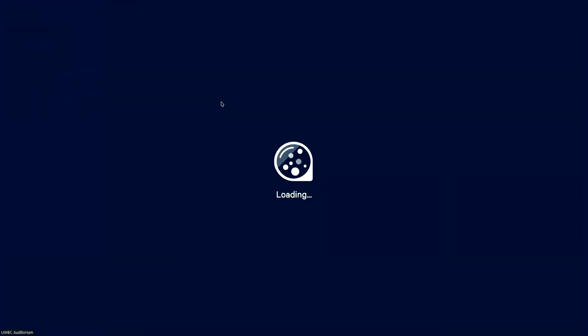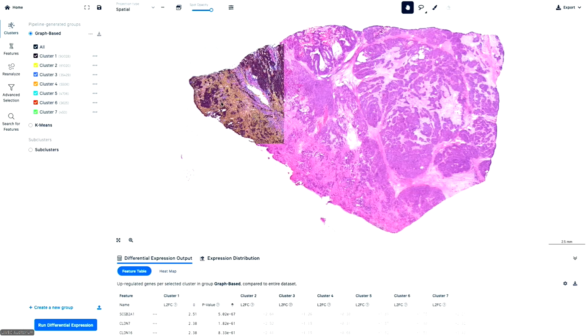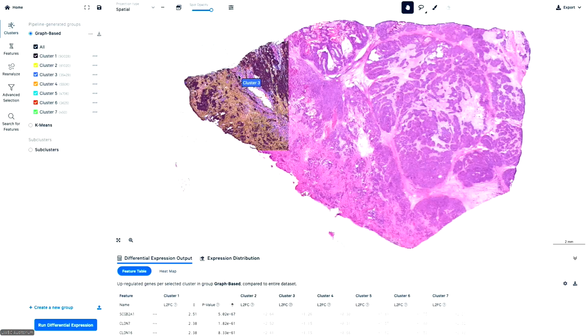One thing I forgot to mention is that the data set I'm going to show you today, the single cell and Xenium, are matched in the sense that we generated the single cell and Xenium data from the same FFPE block. This one here is not matched. We didn't have a Visium HD data set from the same FFPE block, but we did have a human ovarian cancer sample. So it's not the same sample, but it's the same type of tumor. So let's pretend that it's the same.